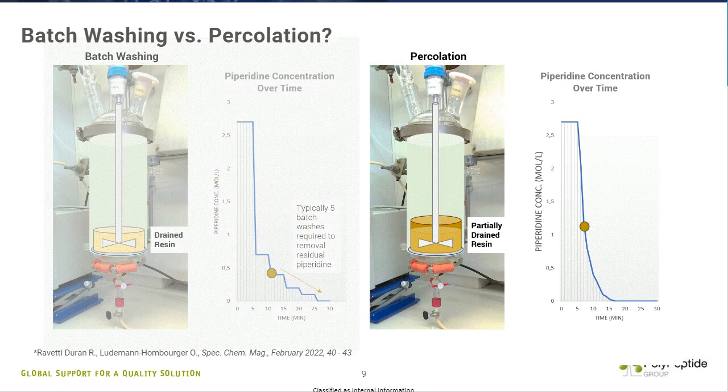But over time, this likelihood increases, and for this reason, I think we really have the endo impurities. But in terms of trace piperidine, we absolutely quantify after each deprotection, so we have a minimal amount of this left. So I wouldn't expect trace piperidine to be the cause of these impurities.